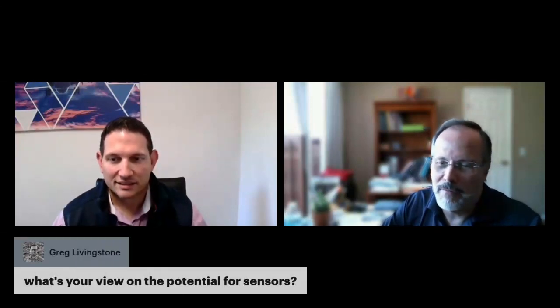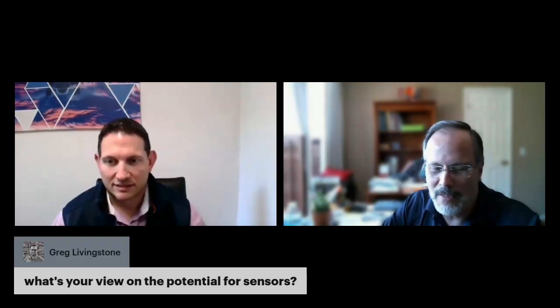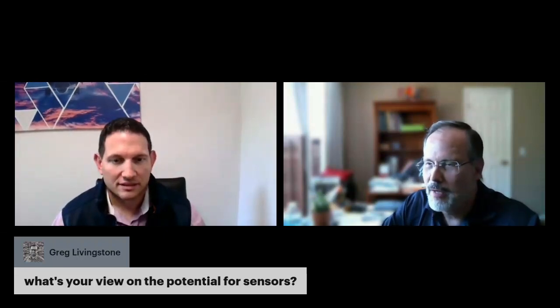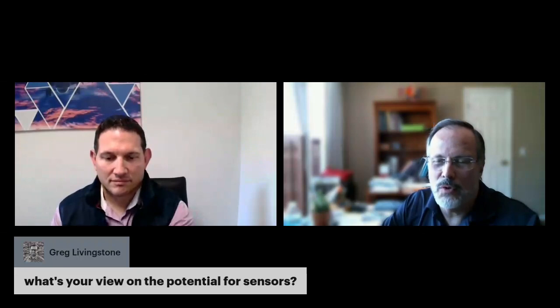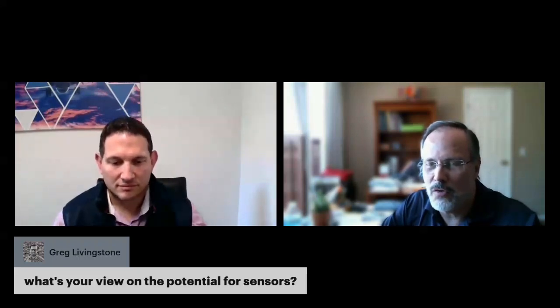There's another question here about the potential of sensors. Well, I see that this is something that is growing. I would say it is moving forward. There are better sensors now than probably just a few years ago. We are not there to say that using sensors will replace formal oil analysis. But certainly the sensors that we have available at this moment in the market may tell us a lot of information that is valuable.